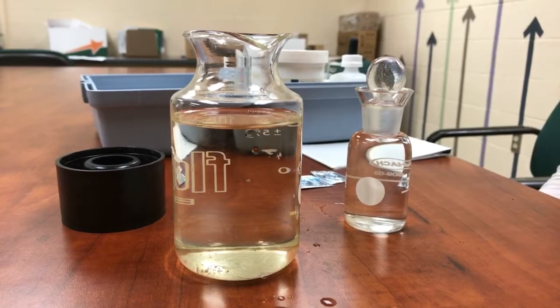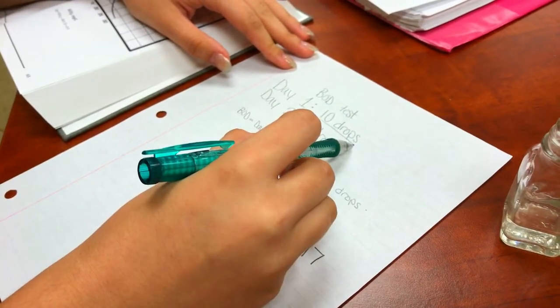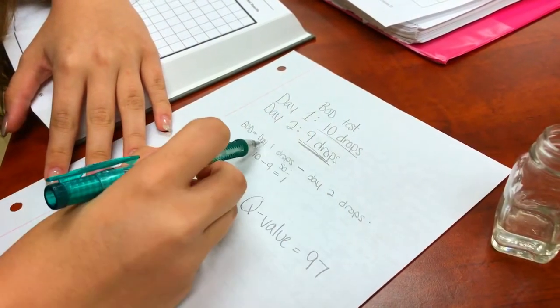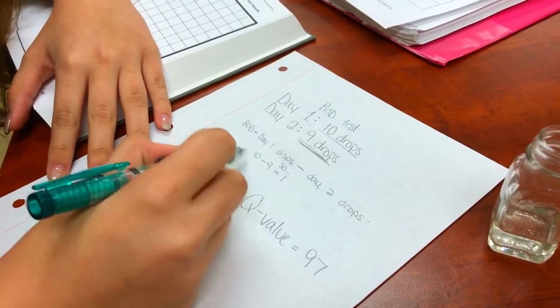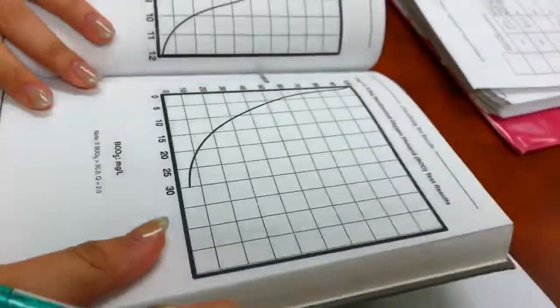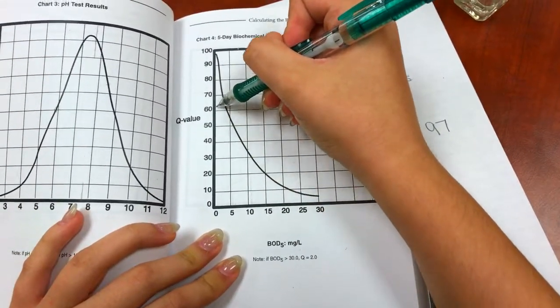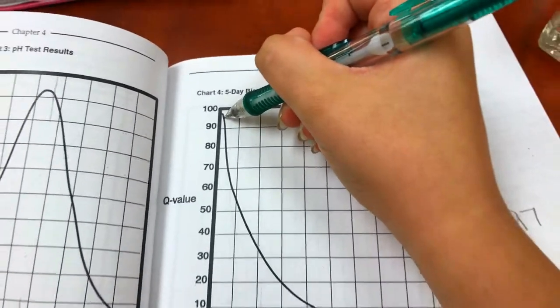We're going to complete the same procedure that we did five days ago and then come back with the results. On day one we got ten drops. On day five we got nine drops. To figure out the BOD, we take the day one drops minus the day five drops — in this case ten minus nine equals one. We then refer to our book page 65 for the BOD, look at the scale, and because we have one, it's looking like about 96 or 97. That's how you find your Q value.